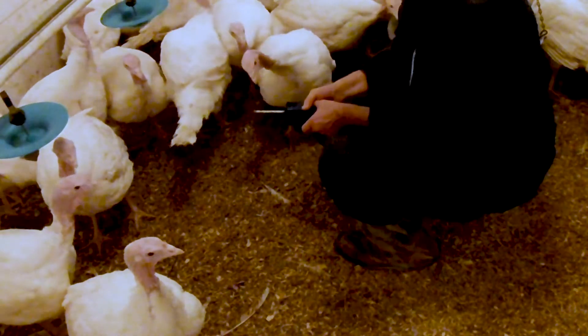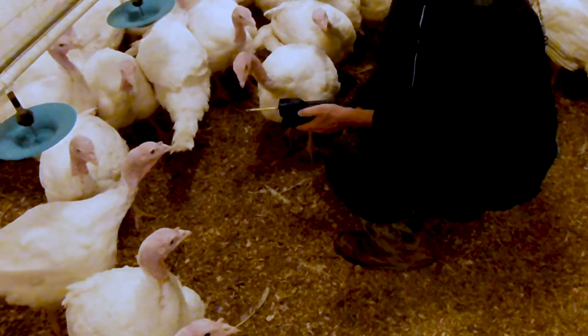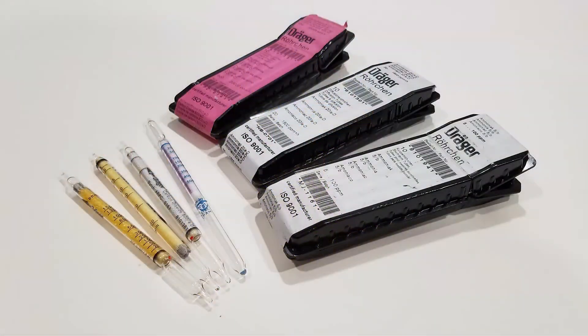Let's talk about using colorimetric or detector tubes to measure ammonia gas levels in poultry houses and other types of barns. There are a few different types, but measurements are interpreted in similar ways and they offer reasonable accuracy compared to other measurement devices.